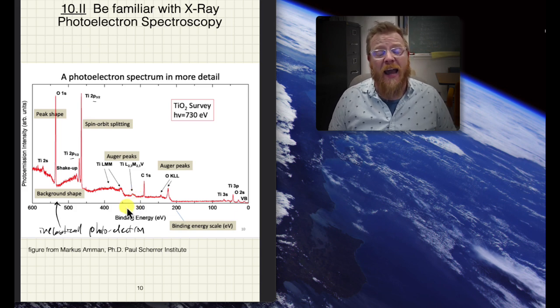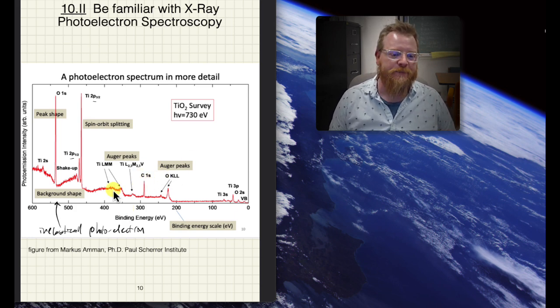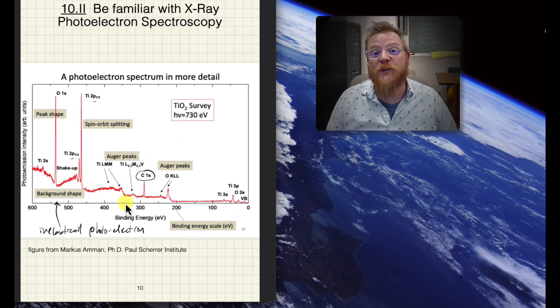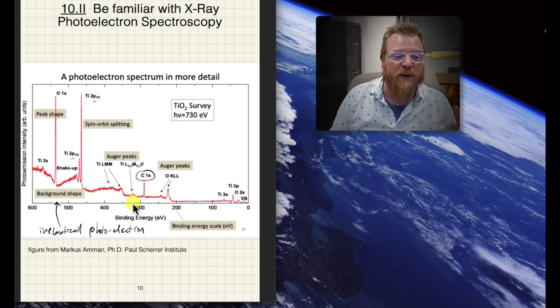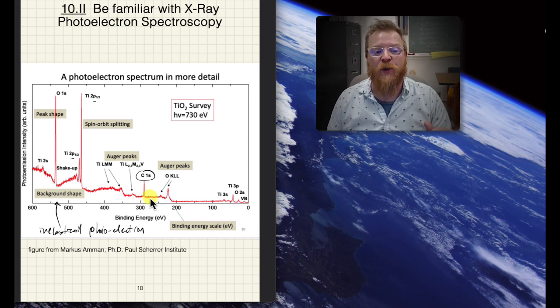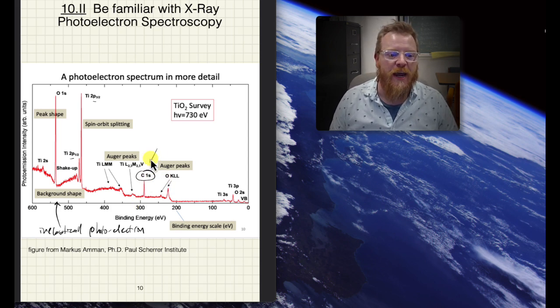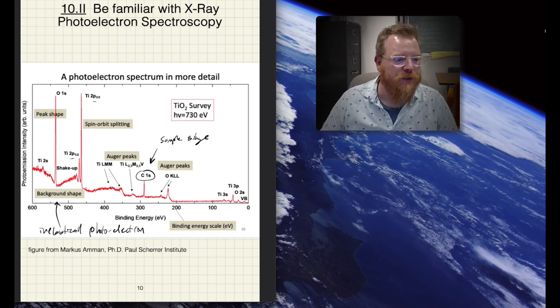So as you might guess, and based on our Spec 1 assignment, spectroscopic deconvolution is an absolute necessity in this technique. And then you might be thinking, this is titanium oxide, so why is there a carbon 1s peak? So typically in XPS, you use a piece of like carbon tape or some kind of graphitic surface to place your sample on. And sometimes we can get electrons emitted from that carbon stage. So that's from the sample stage. So we'll note that there. Almost always some carbon shows up in this technique from the sample stage.